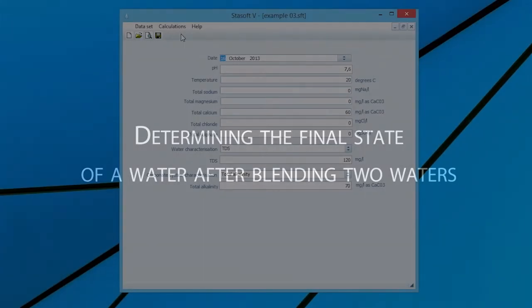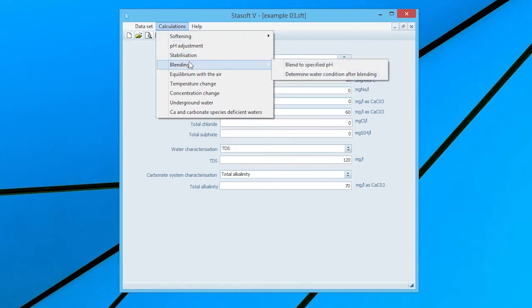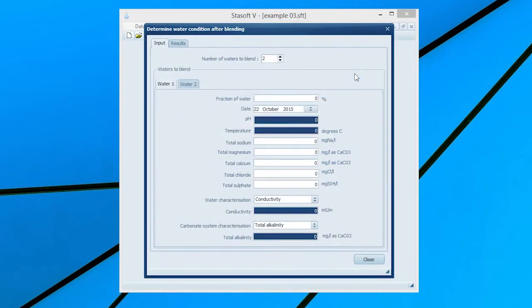Determining the final state of water after blending two waters. Selecting the Determine Water After Blending option in the Blending menu will bring the Determine Water Condition After Blending input window onto the screen.